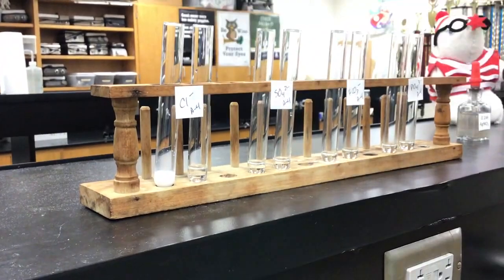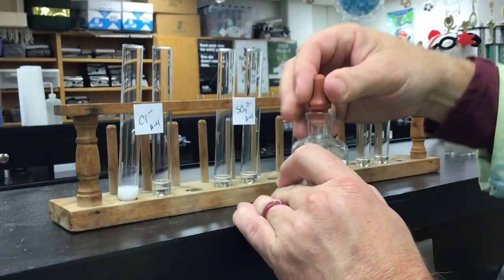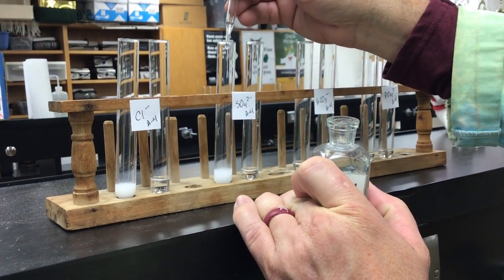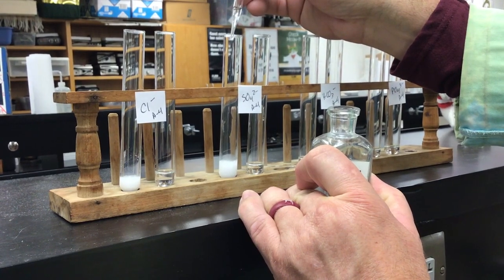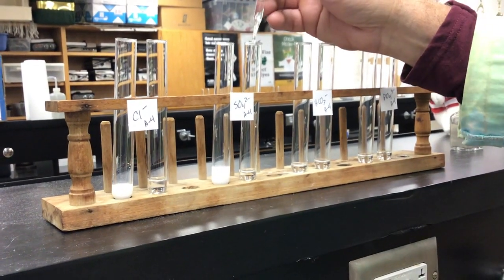And we'll go do sulfate next, so I'll add some barium chloride to that solution and see what we get as a result, about a milliliter. I'll do the same to our unknown rather.